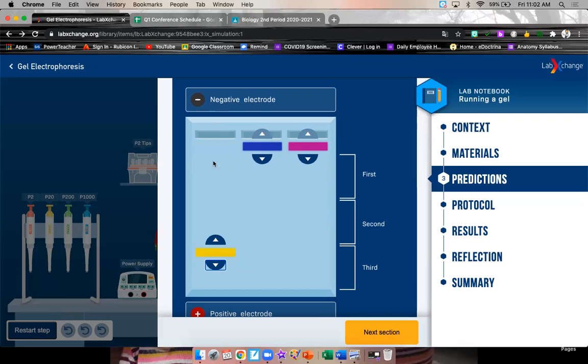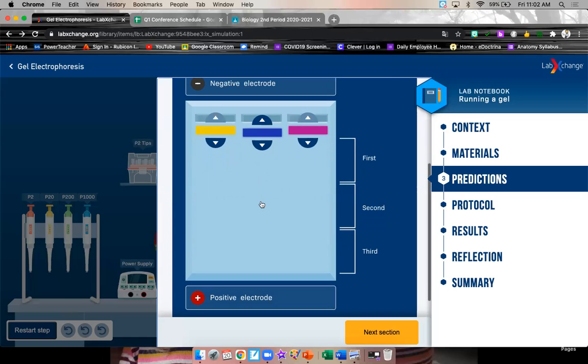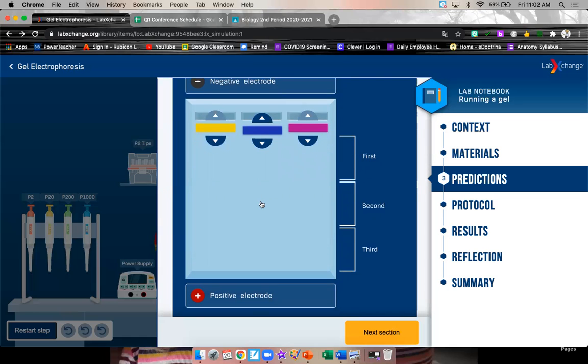So you're going to drag this to either, oops, that's not behaving for me. First, second, or third, wherever you think it's going to be. And this one, first, second, or third. And purple, first, second, or third. Don't be nervous about being wrong. This is a hypothesis. This is your prediction where you think it's going to be. This is smallest. This is medium. This is largest.